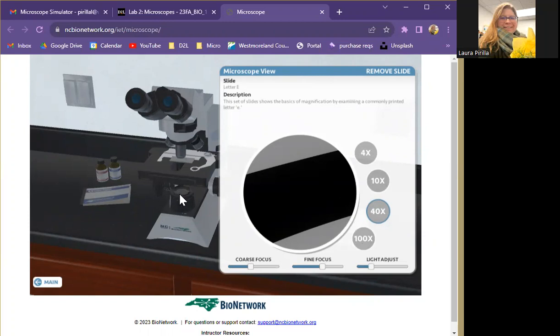This is the light here and it shines. And then there's an opening down here that looks like, if you've ever seen an old-timey camera shutter, or if you know anything about how the human eye works, it would be like the iris of your eye. It can open and close to allow more and less light through.